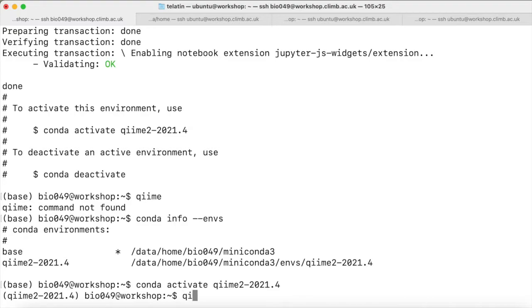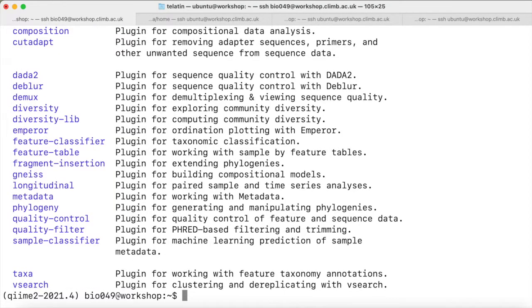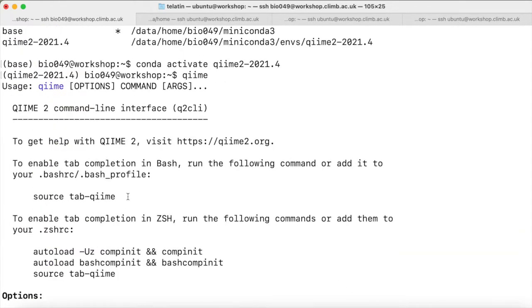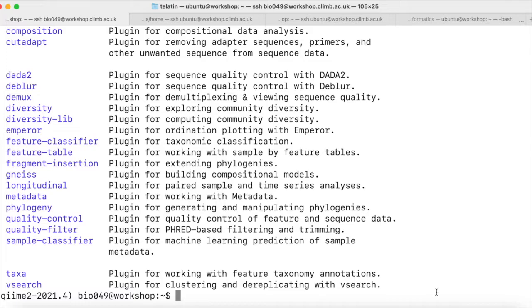Now, if we run QIIME, we will see that QIIME 2 has been installed and we can access the plugins from QIIME 2. Within the QIIME 2 environment, we can access QIIME and all the packages that QIIME installed for us — for example, Vsearch.